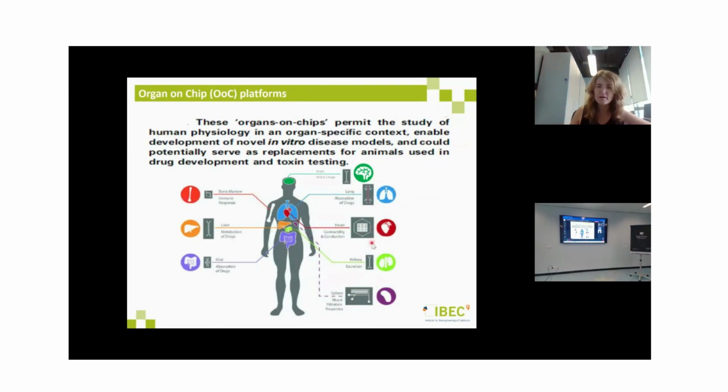Also, the mimicking of the functionality of a heart has been reported, with myocardial cells beating inside the chip, and different applications such as a spleen, as we reported some years ago. And nowadays we are working in brain, which is the one that I'm going to show you. But as you can see, there are many different systems reproduced in these organ on a chip systems.